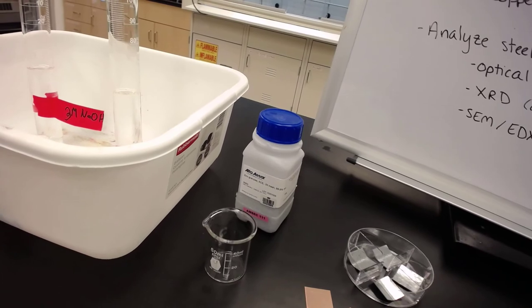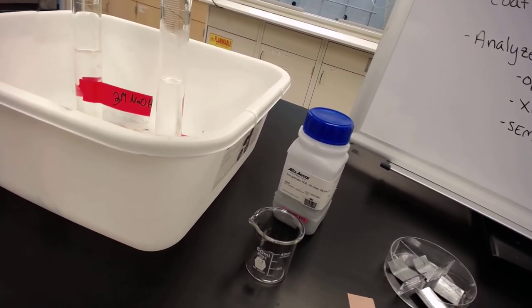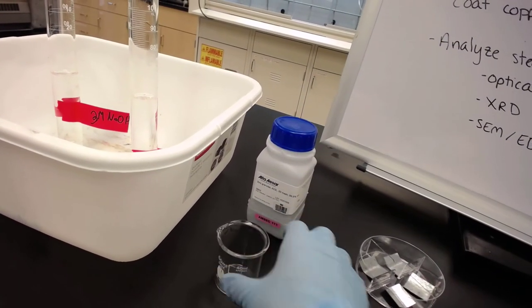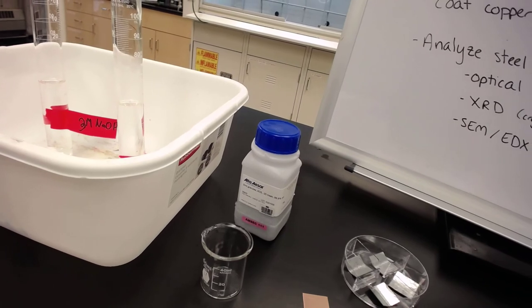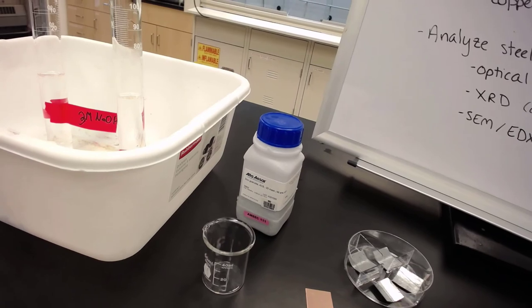When we coat our copper, we're going to use this 3 molar NaOH with zinc in the beaker, then add the copper to coat it. Finally, we'll put it on a hot plate to anneal it.